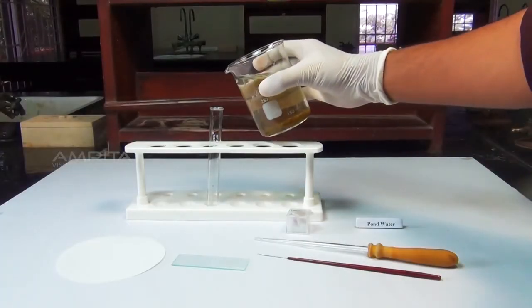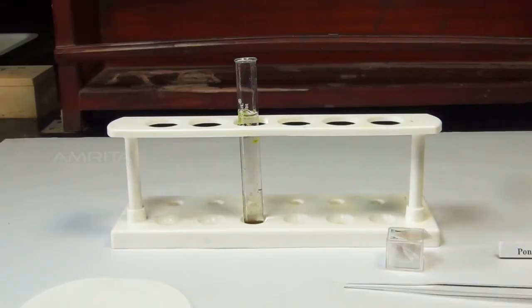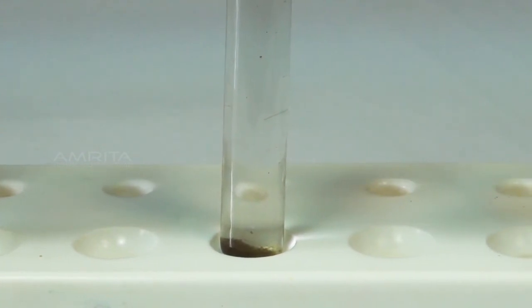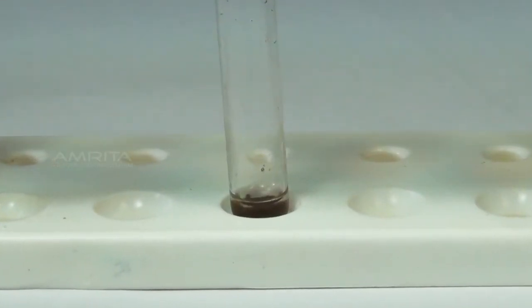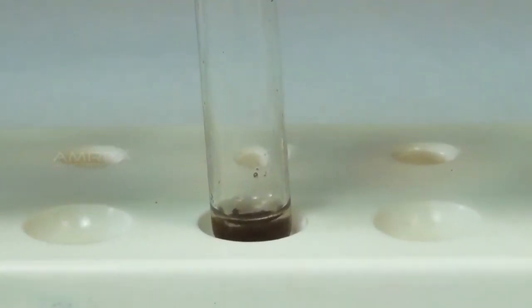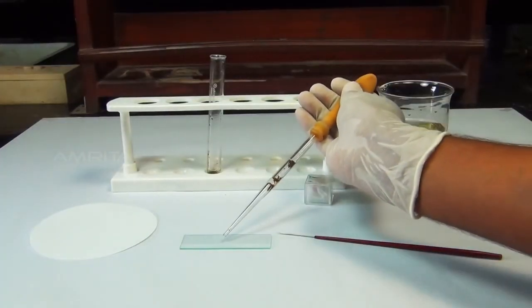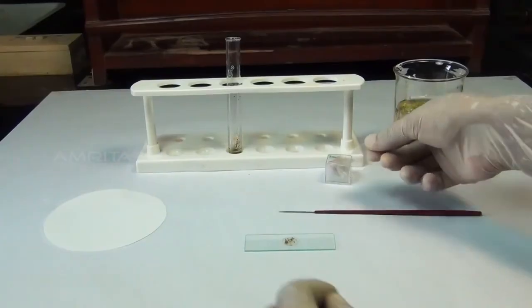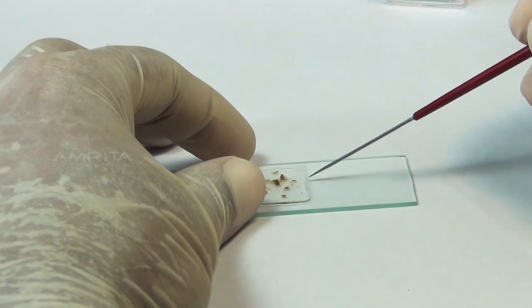Procedure: take a beaker containing pond water and pour it into a test tube. Leave the water sample undisturbed till the sediment settles to the bottom of the test tube. Decant the clear water, leaving concentrated sediment at the bottom of the test tube. With the help of a dropper, transfer a drop of water from the test tube to the center of a glass slide. Take a cover slip and place it gently on the slide with the aid of a needle.